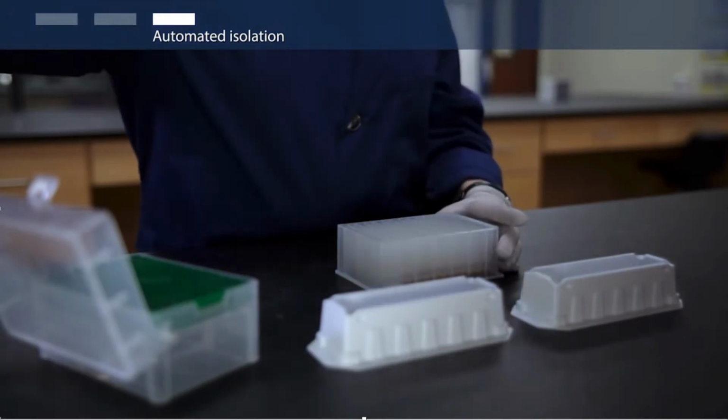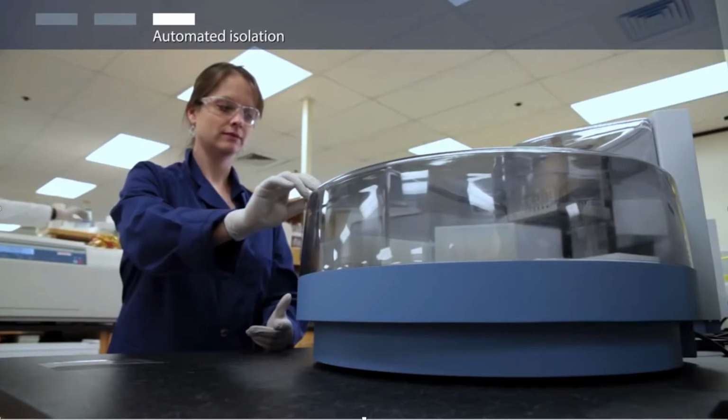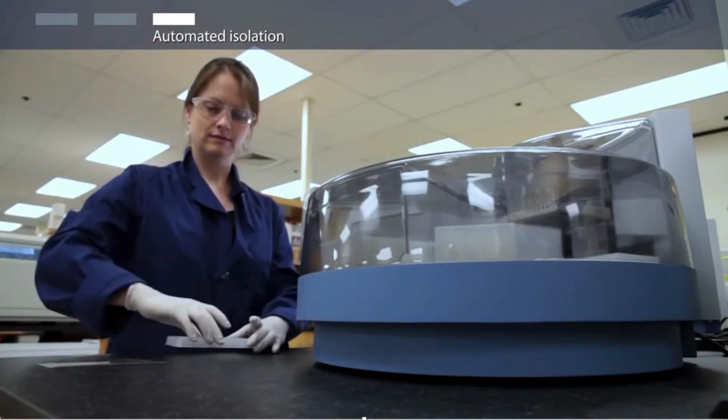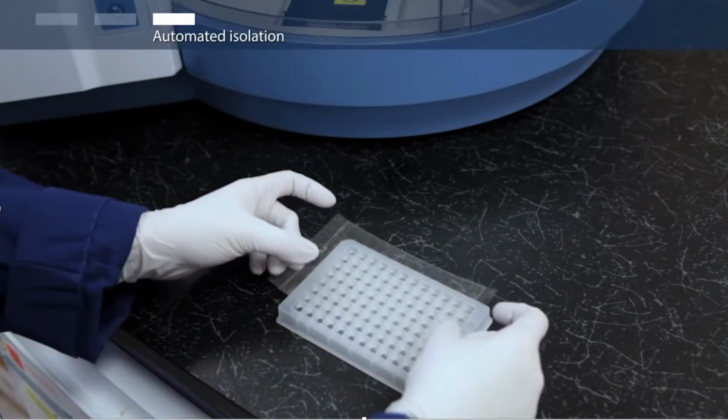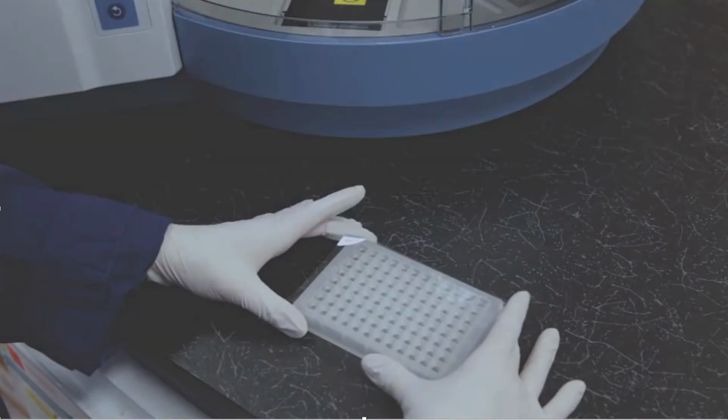At the end of the run, your high-quality RNA sample is ready to be used in RT-PCR or in another downstream application. Or it can be stored at -20 degrees Celsius for later analysis.